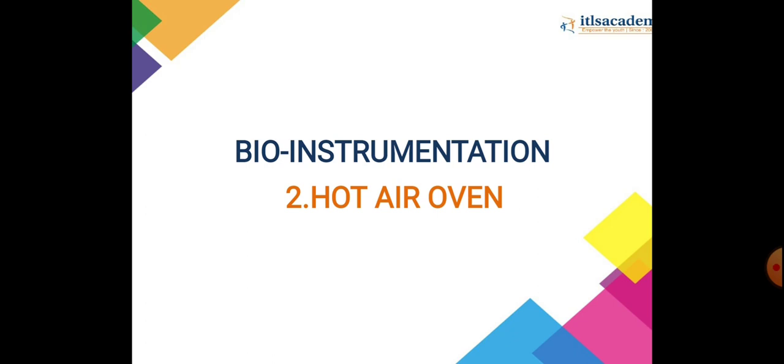Today I am taking the second topic under bioinstrumentation. Let me remind you that it is a sterilization technique, and we have done a video on the sterilization technique, so do refer to that video also. It is the second part of that video. In the previous video we discussed the different sterilization techniques, and the autoclave, which depends on moist heat sterilization, has been covered in that video. It is linked with this, so do refer to that video also.